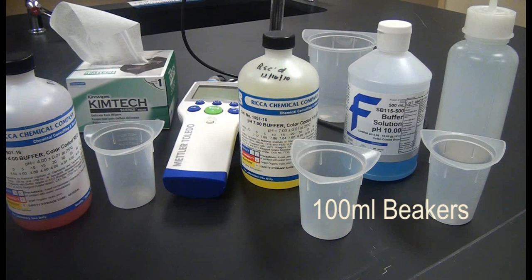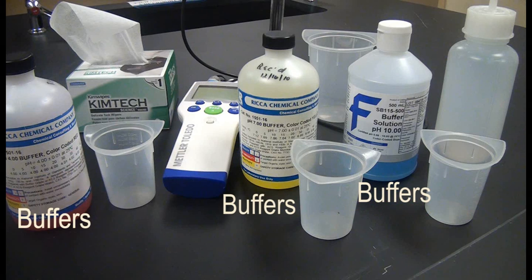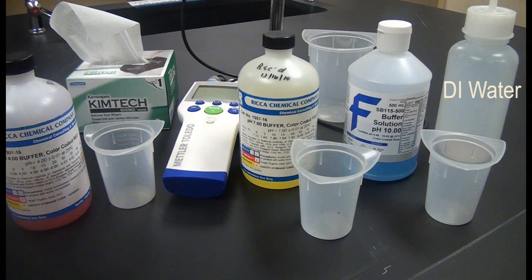A pH meter, small plastic beakers, pH buffer solutions, a 1 liter DI water bottle, a 250 ml waste container or beaker, and a supply of chemiwipes.